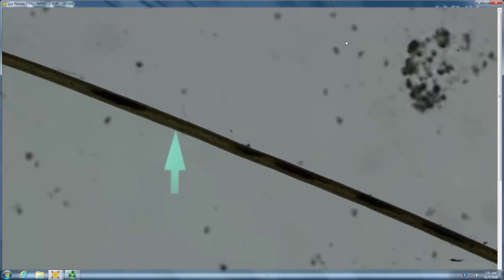Sorry for those online, it's not projecting really well. But darker pigment in the center of the hair, and it's not pigment, it's airspace. So airspace, lack of airspace, airspace, lack of airspace. What's that? Is that spangled hair? Yes, spangled hair, which is also called pili annulati. And it's the only hair abnormality that people like, because your hair is sparkly.